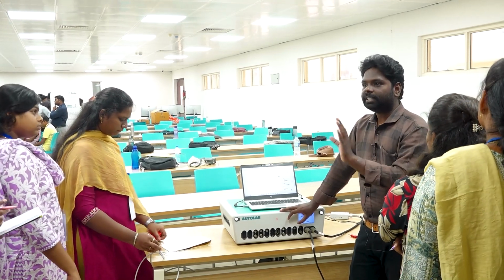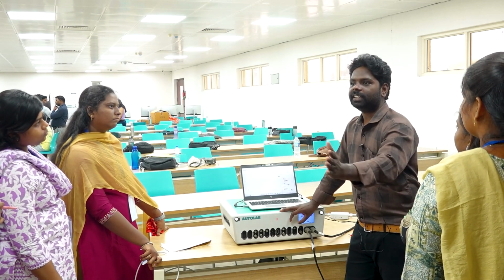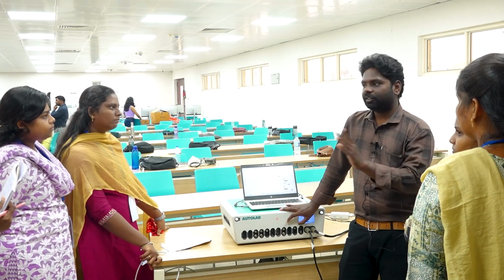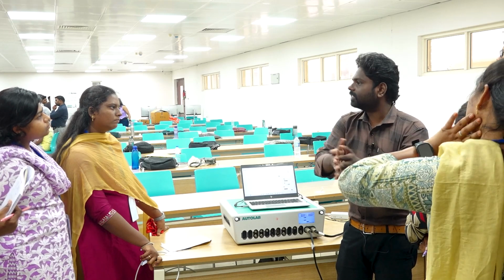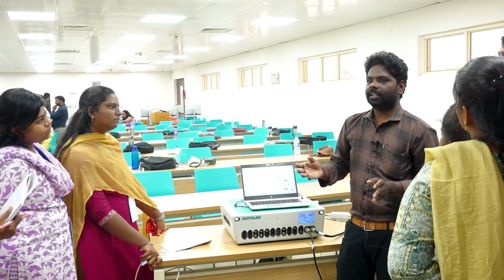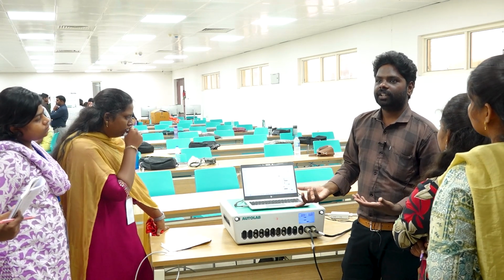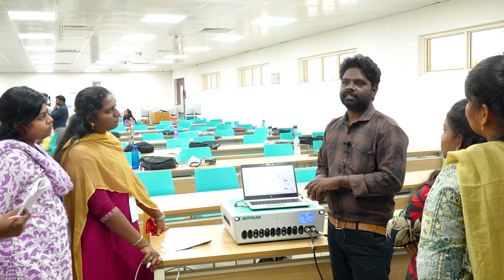But still we didn't get any values. We simply know this is internal resistance, charge transfer, double layer, and Warburg diffusion is there. But we need values, right? This much resistance, like 100 ohms, 200 ohms, 300 ohms, this microfarad, this farad capacitance, we need to find out, right? For that we need to do circuit fitting.